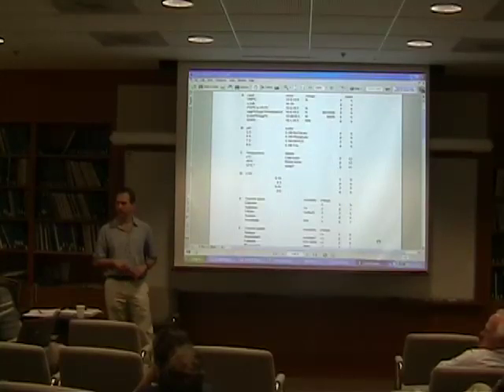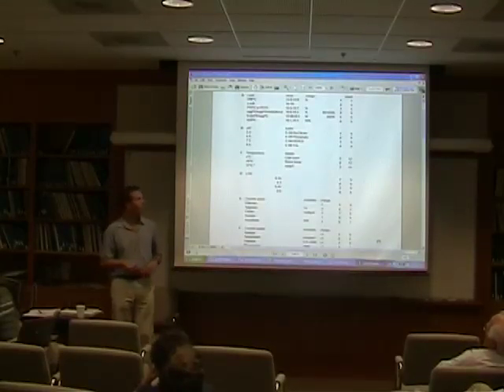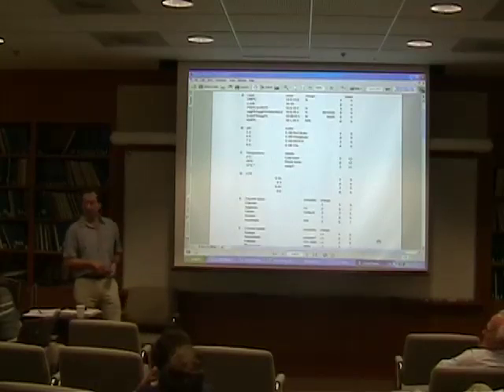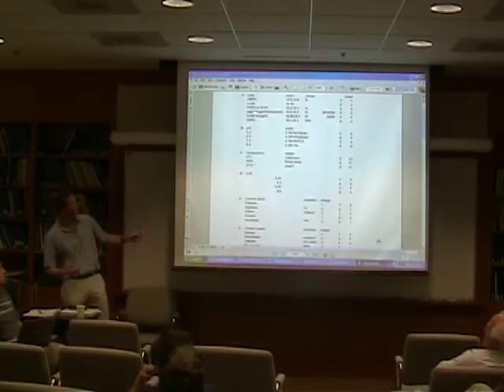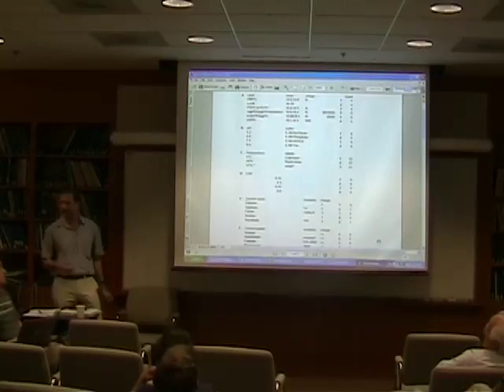I used to do this mixture also with the others, and I don't see honestly a difference between egg PC, HDA with or without it. Maybe you can remove it, but I would say that we have to keep it in mind. Would it be better as a separate factor? You could also take it out as a lipid and just use it as a lipid additive. I say cholesterol, but I can also have sphingomyelin, which is one important lipid, and up to now, it seems that no one works.